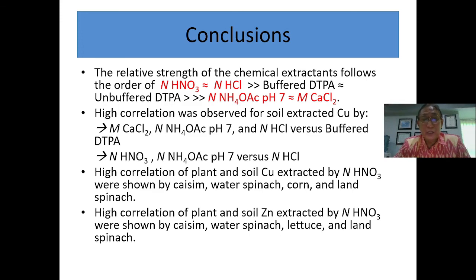Higher correlation was observed for soil extracted copper by calcium chloride, ammonium acetate, hydrochloric acid versus buffer DTPA, and also for nitric acid, ammonium acetate versus hydrochloric acid.